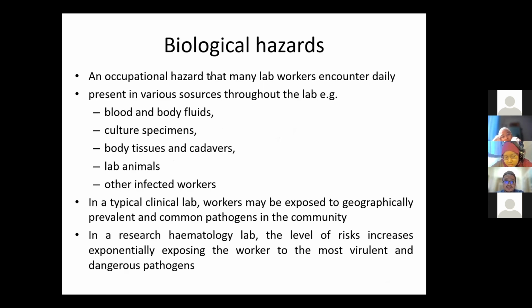Biological hazards are an occupational hazard that many lab workers encounter daily, present in various sources throughout the lab, like blood and body fluids, culture specimens, body tissue and cadavers, lab animals, and other infected workers. In a typical clinical lab, workers may be exposed to geographically prevalent and common pathogens in the community.